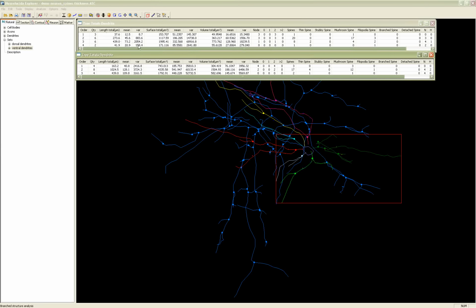I'm going to pause now for any questions about this transition to Neurolucida Explorer.